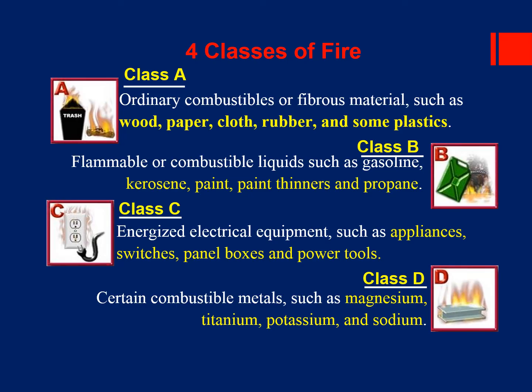And moving to fire safety in the labs. There are 4 classes of fire. We can categorize them into class A, B, C, and D. Class A fire is generated from wood, paper, cloth, rubber, and some plastic, like ordinary combustible material. Class B is generated from kerosene, paint, thinner, propane and organic solvents. Class C is generated from electrical appliances, and class D is from combustible metal material like magnesium, sodium, potassium, titanium, right?